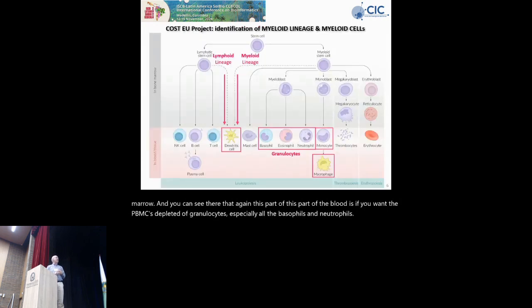So sometimes, depending on the nature of the sample that you are analyzing, to resemble what is happening in hematopoietic cell production is not easy, and to distinguish all these different cell types and subtypes.